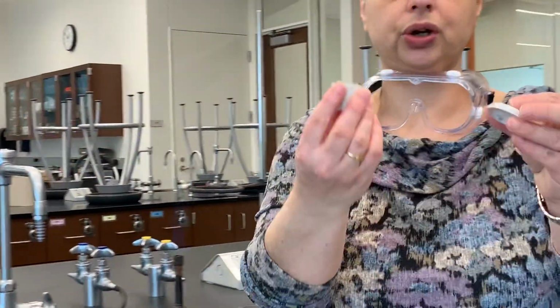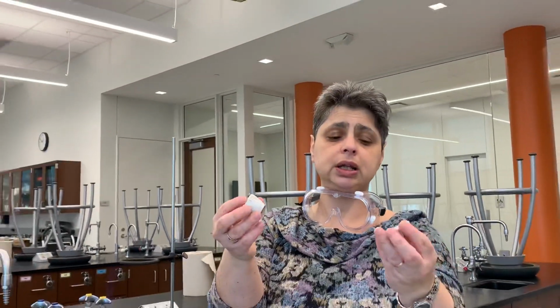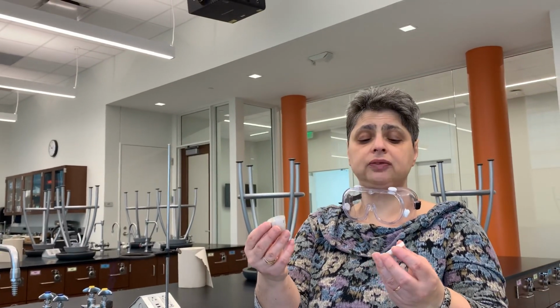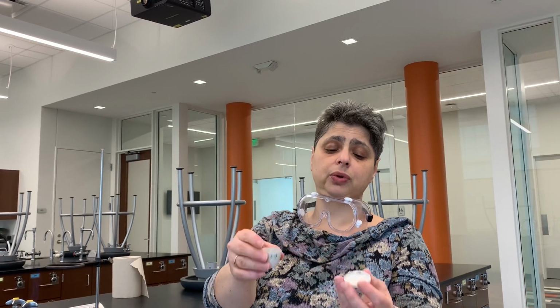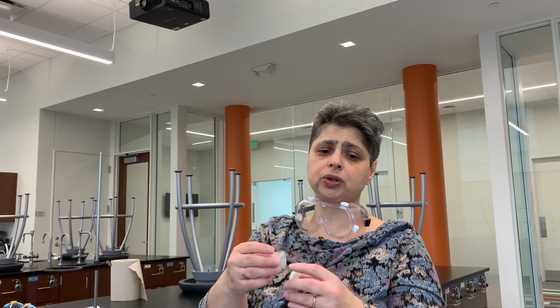The container I'm using for this is called a crucible. The crucible is made of a porcelain. It's a heat-resistant porcelain, meaning it can withstand very high temperatures, so when I heat it, I can be sure that it will not crack. One thing to ensure it will not crack, though, is to look it over on both inside and outside to make sure there are no hairline cracks in it, because if there are, it most certainly will break and shatter during heating. So I have a crucible here with the lid.